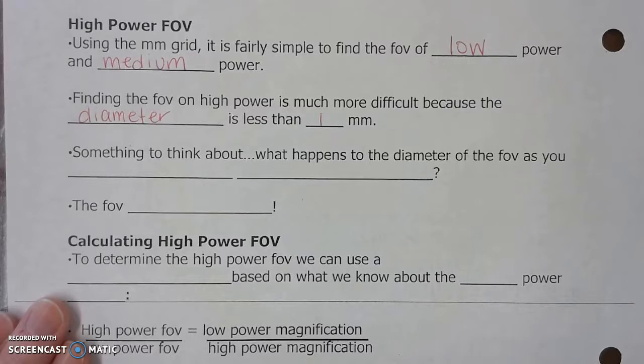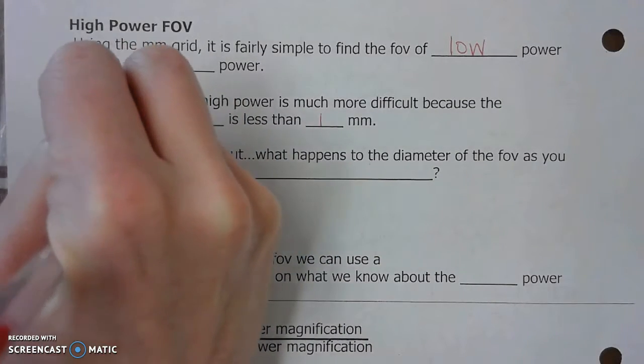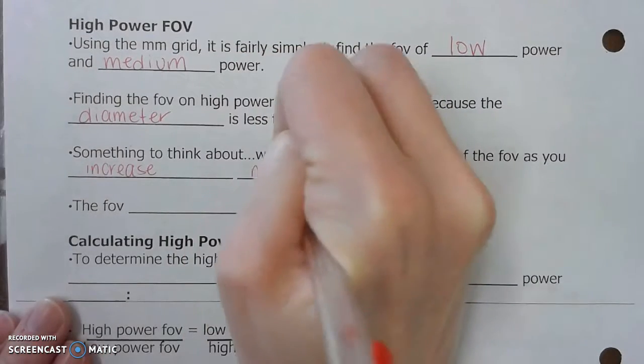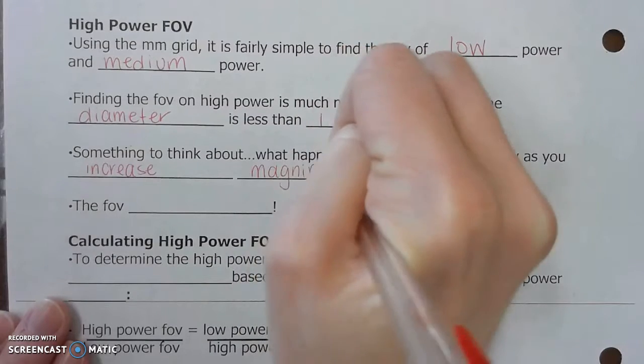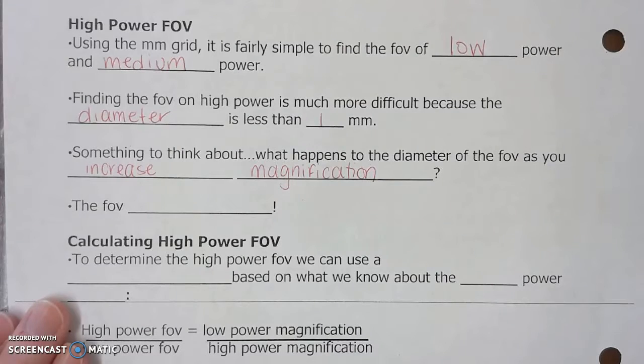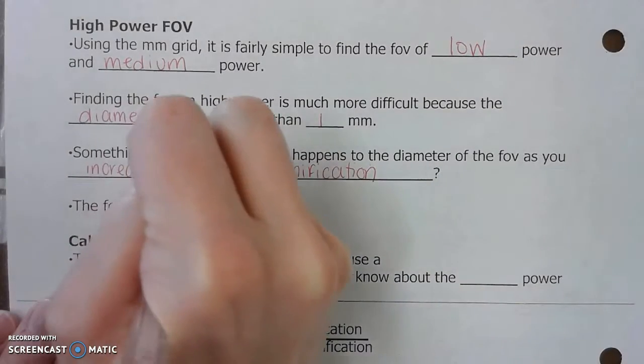Something to think about. What happens to the diameter of the field of view as you increase the magnification? As you go from low power to medium power to high power, you increase the magnification, but the field of view decreases.